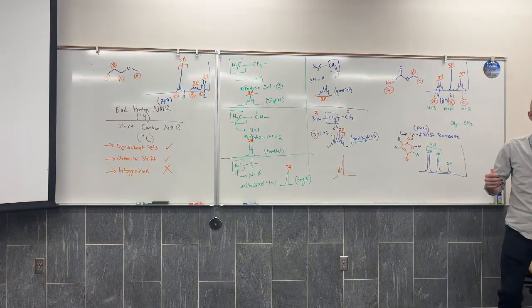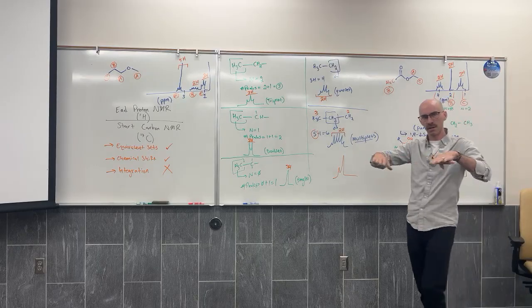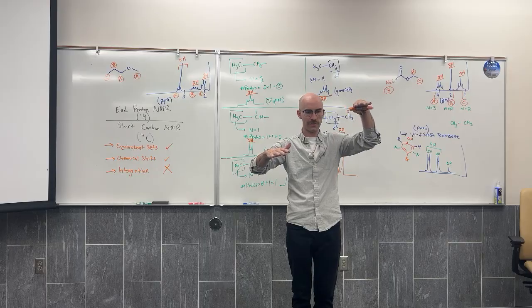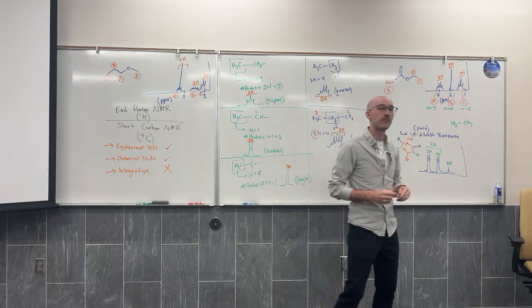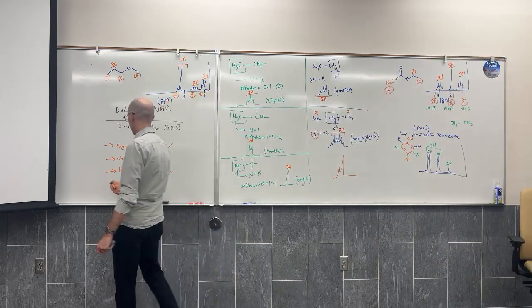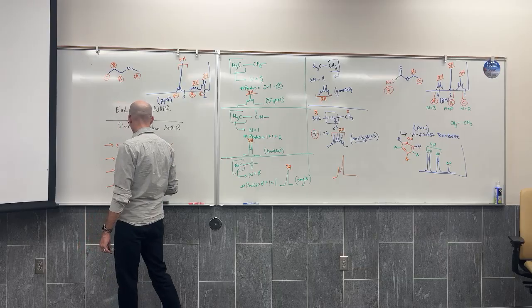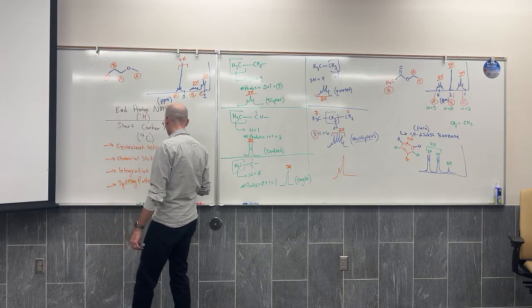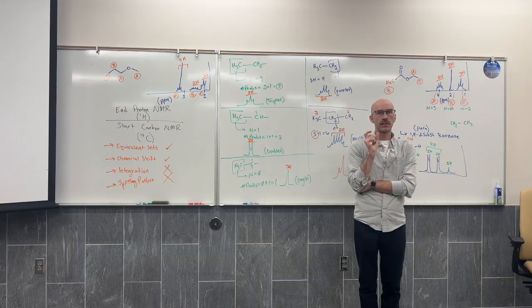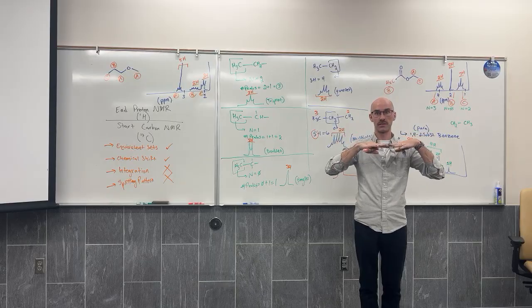And oddly enough, you can't really go by height either, because sometimes the same number of carbons are producing signals and they just have different heights because they're giving off different intensities of signal. It's weird stuff. Splitting pattern: you won't see it. Hydrogen nuclei communicate through their covalent bonds between their carbons.